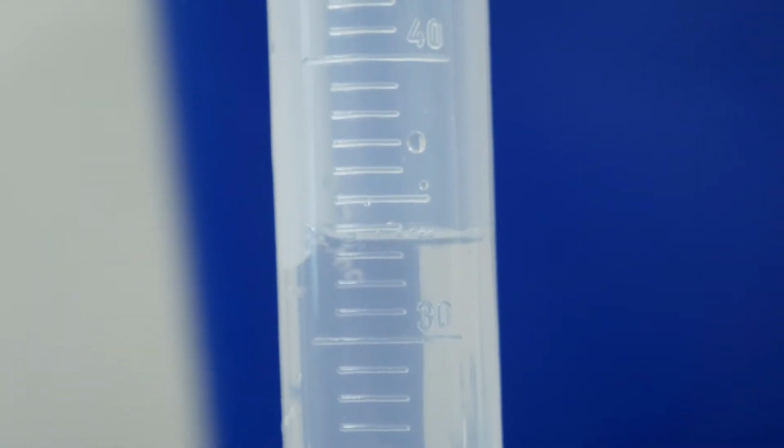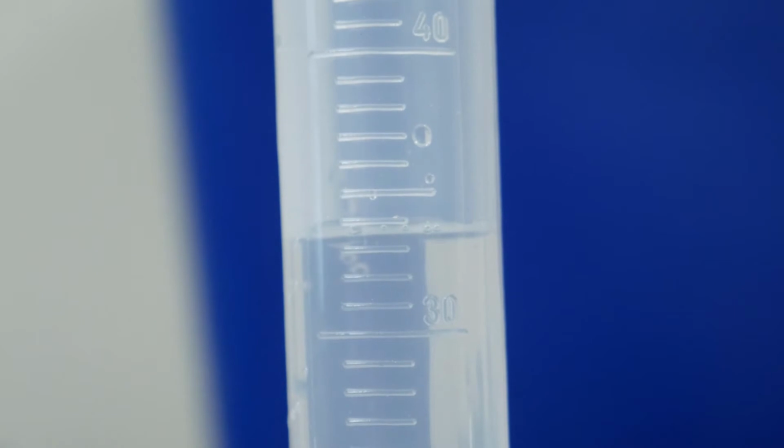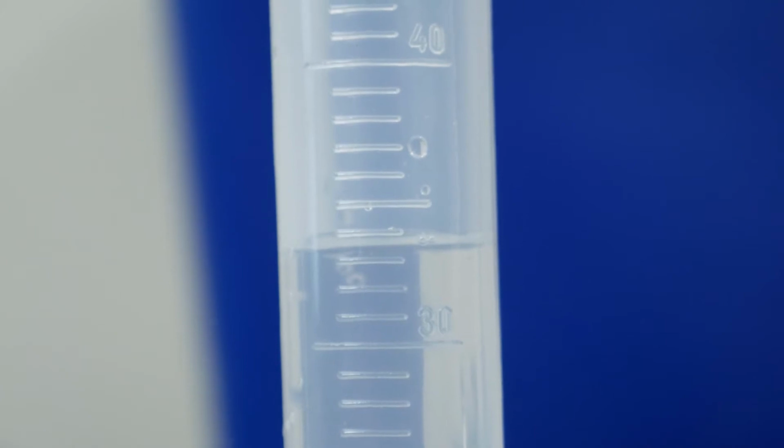All right, so our water now is in the graduated cylinder. So on your data sheet, I'd like you to make note of where that water line is. Again, the bottom of the meniscus, and just estimate it to 0.1 milliliters. So looking at this right now, it looks like it's maybe between the 33 and 34 milliliter mark.